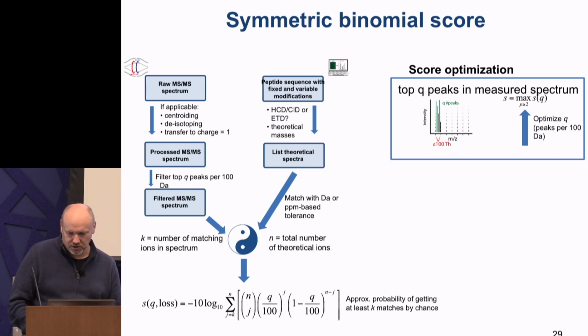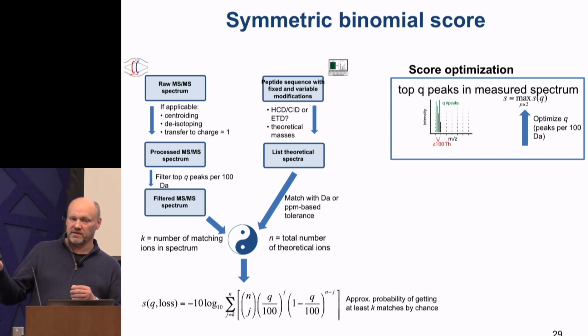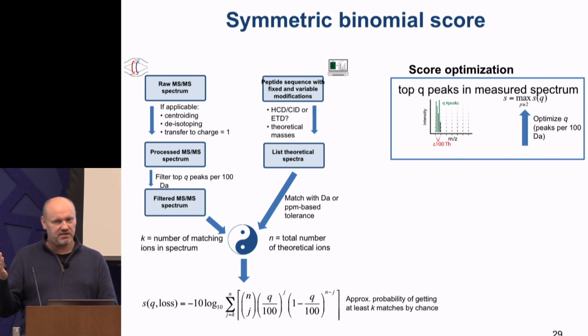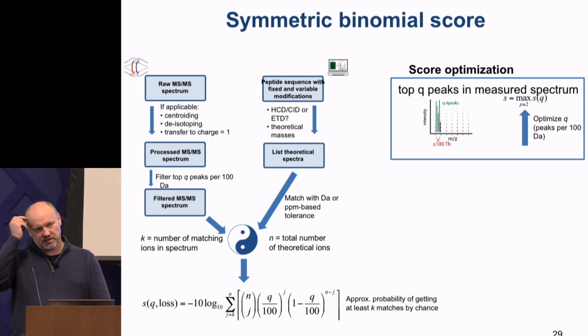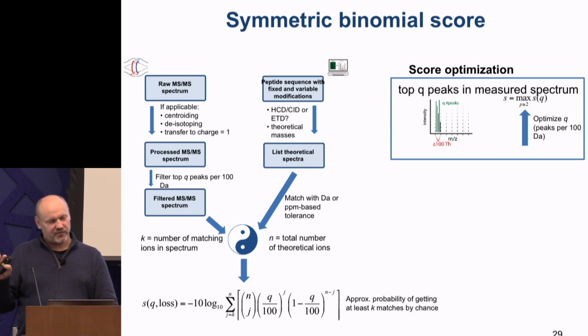And it can. The way we use it in the Andromeda search engine is this: how do we now make use of the intensity? We already made use of intensities to some extent in Andromeda by scoring a match better if a high-intensity measured fragment is explained. If a high-intensity measured fragment is explained, that's better than if a low-intensity measured fragment is explained. But it was asymmetric, so that was not the same in the other direction. For the theoretical spectra, nobody cares whether a high or low intensity fragment is explained.